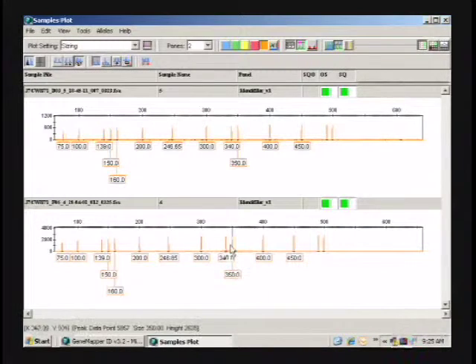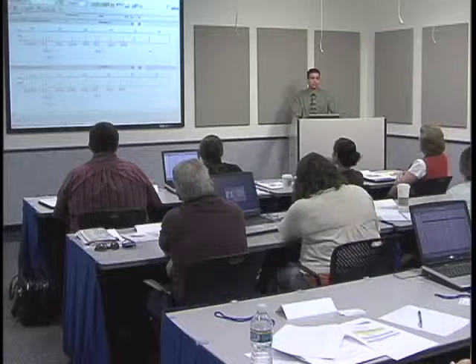Is that correct? Yeah. Okay. So it looks like with the 2 washes, the Liz got higher. The lowest peak is about 1500 RFUs, whereas over here the lowest peak is about 400. So that's, once again, something y'all should experiment with, the number of washes y'all do.